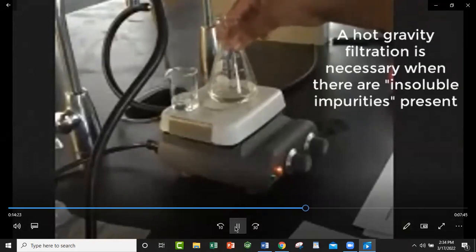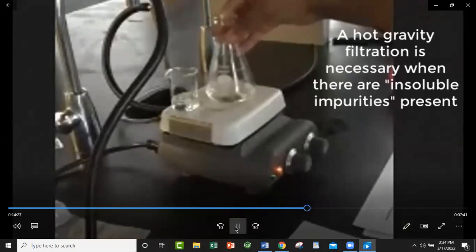All of these samples are really good for one reason, or two reasons. Number one, we haven't had to do a hot gravity filtration. A lot of times when you're dealing with a recrystallization and you have some impurity in there that won't dissolve, you can do what's called a hot gravity filtration. We can just take it while it's still hot, filter it through a glass funnel, and get that insoluble material out of there. But we haven't had to do that, so that's good.